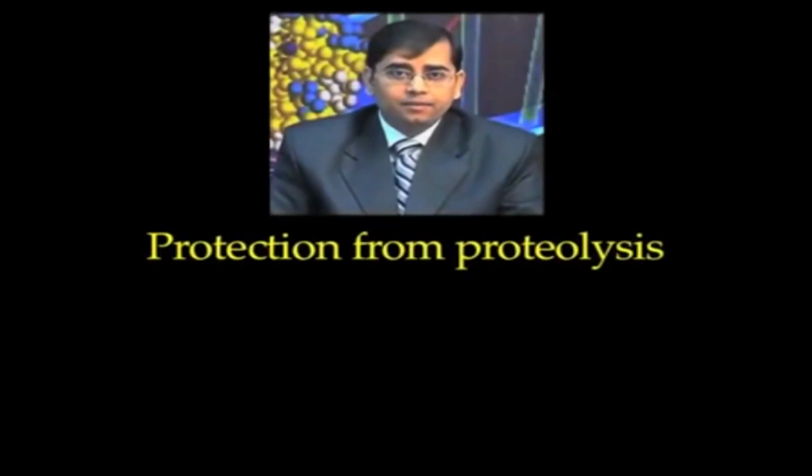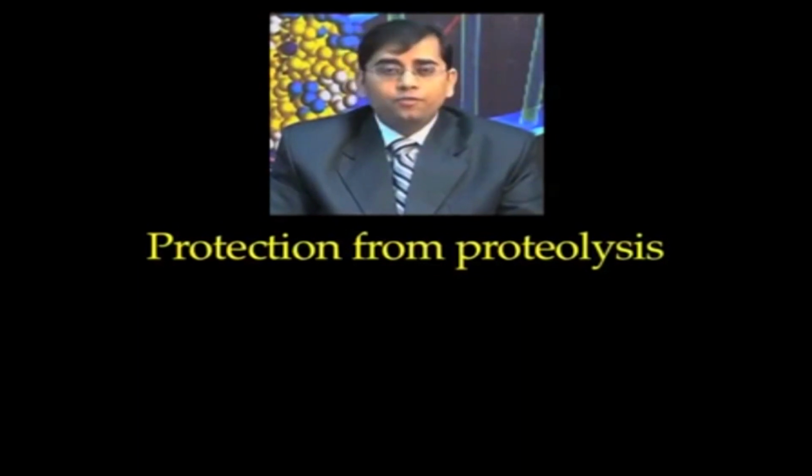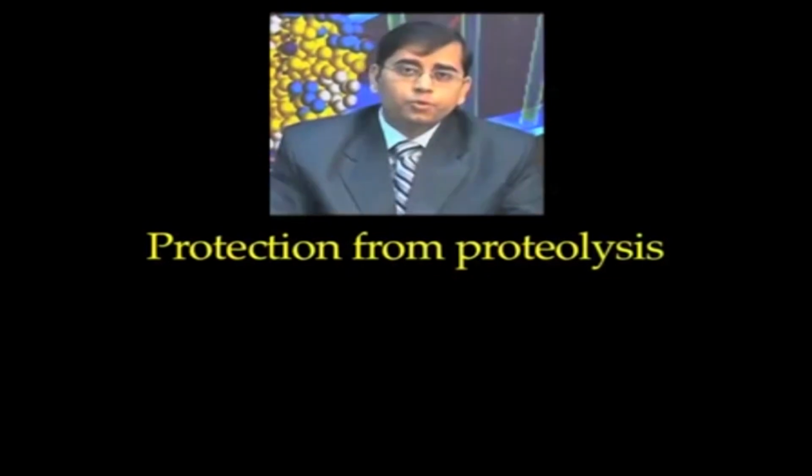Now, you have tried to break open your cells and release all the protein components and other cellular components present inside the cell. But often during this process of grinding and lysis, you may degrade some of the protein, and you need to protect your protein from the proteolytic activities of various enzymes. So, protection of your protein components from proteolysis is very important during protein sample preparation.